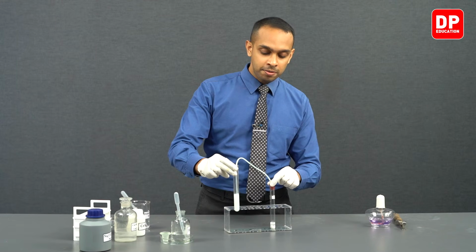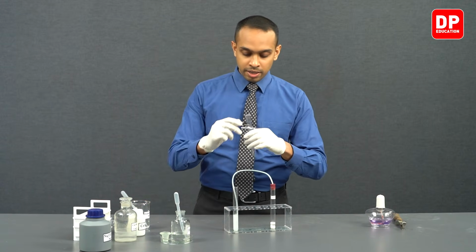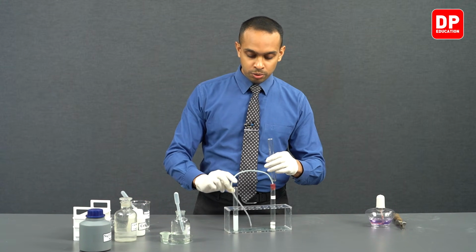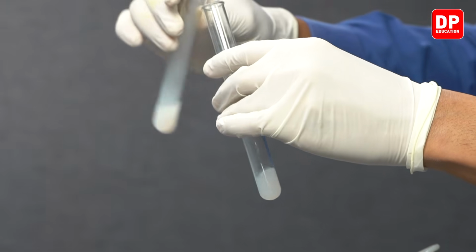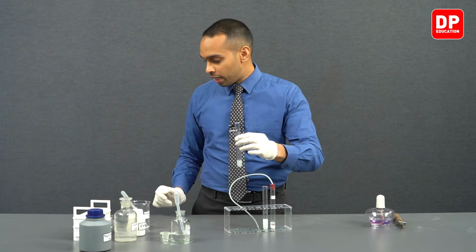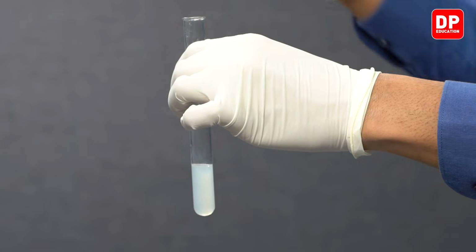So to observe lime water turning clear, we can take another test tube and take a small portion of this solution into that test tube. And to make this reaction happen a bit faster, we can dilute this suspension that we have over here.